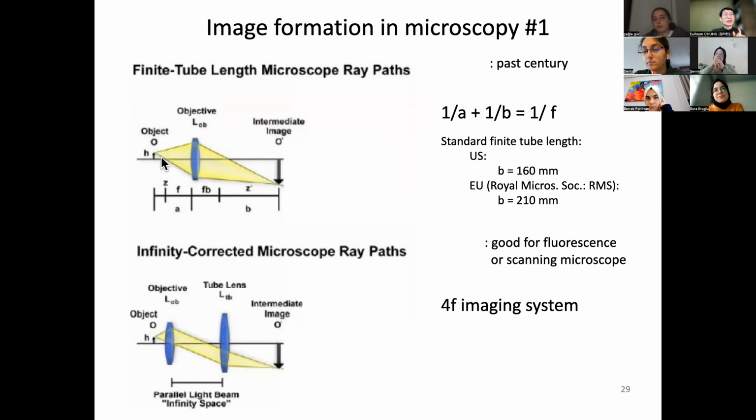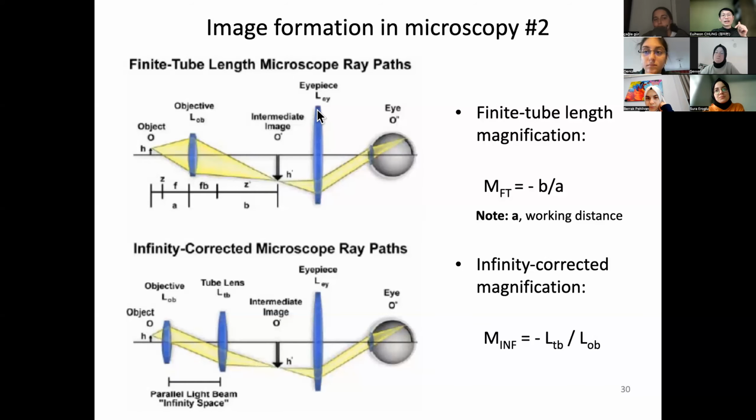But the point is, when you are using a microscope, you have this lens formula. In fact, the lens makes an inverted image, and you have an eyepiece. And your eye contains another lens, so you can see the light coming in focuses onto your retina. And that's how you are using a microscope. But this is an old one, I would say.